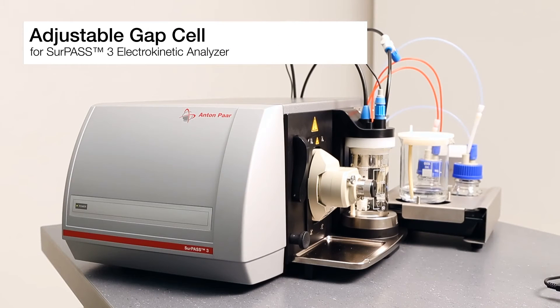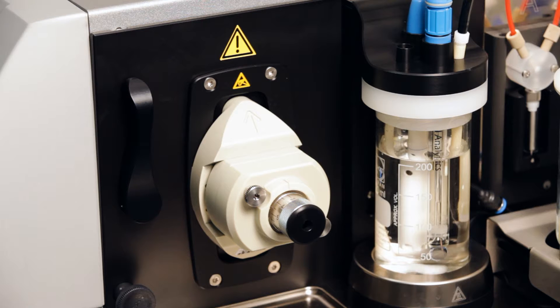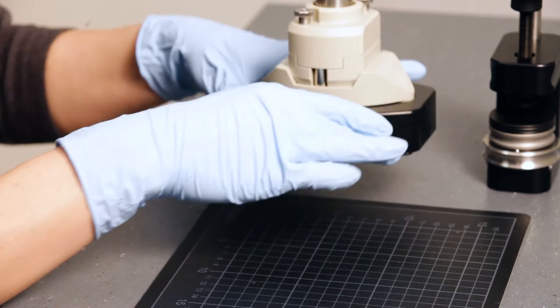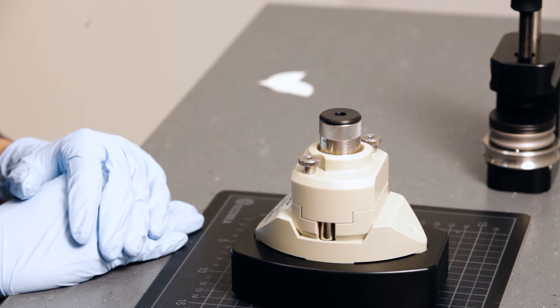This is the adjustable gap cell for the Surpass 3 Electrokinetic Analyzer. It's a measuring cell for small rectangular pieces of flexible or rigid planar samples. A great advantage of this cell is that you are working with small sample surfaces in a fully sealed system. This is particularly useful for analyzing the surface zeta potential of membranes, for example. This video shows you how to mount your sample in the adjustable gap cell and how to mount the cell in Surpass 3.